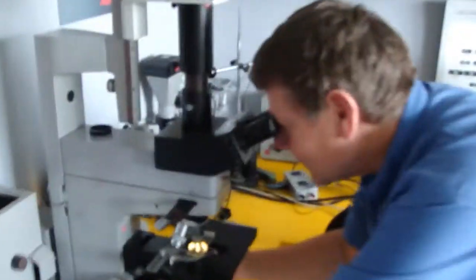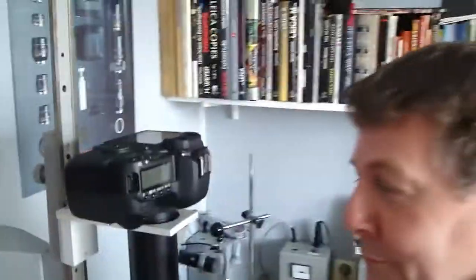I'm here with Fred Hess, our Dutch natural photographer and biologist. Hello Fred, what are you testing here exactly?